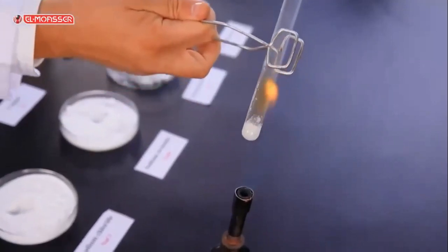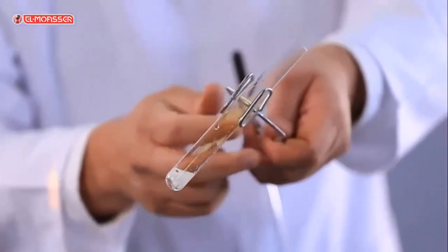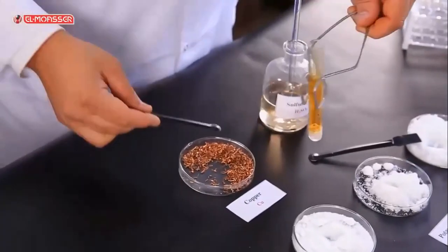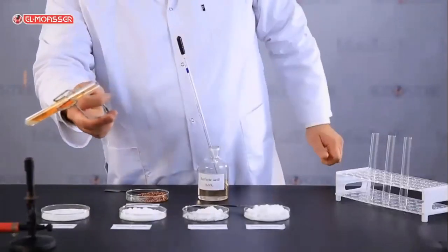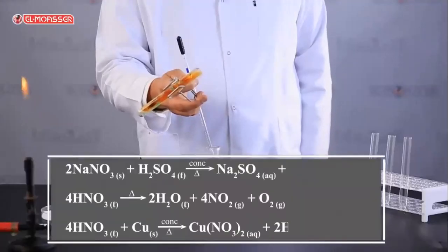Brown vapors of nitrogen dioxide gas evolve due to decomposition of nitric acid. The density of the vapors increases by adding copper filings and a green substance of copper-2 nitrate is formed.